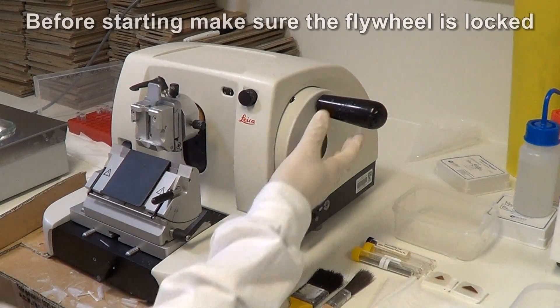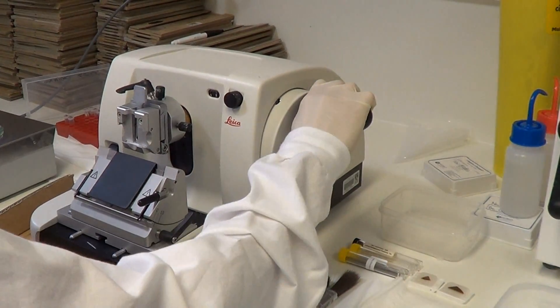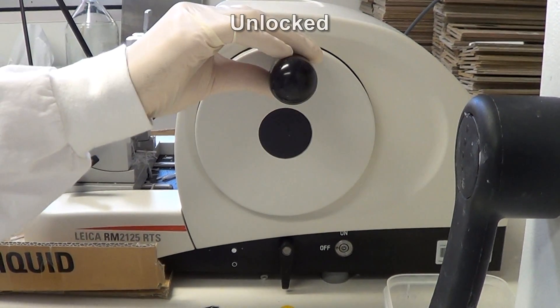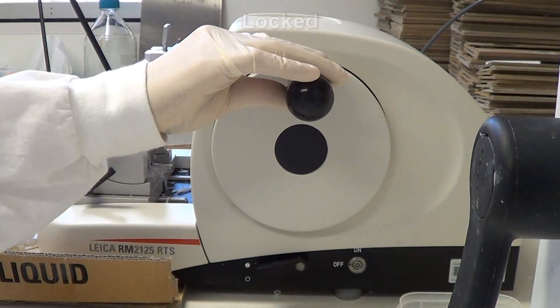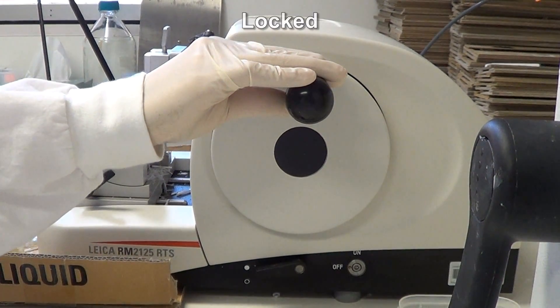Make sure the flywheel is locked. The flywheel must always be locked when manipulating the block, inserting the knife, or when there is a break in cutting.